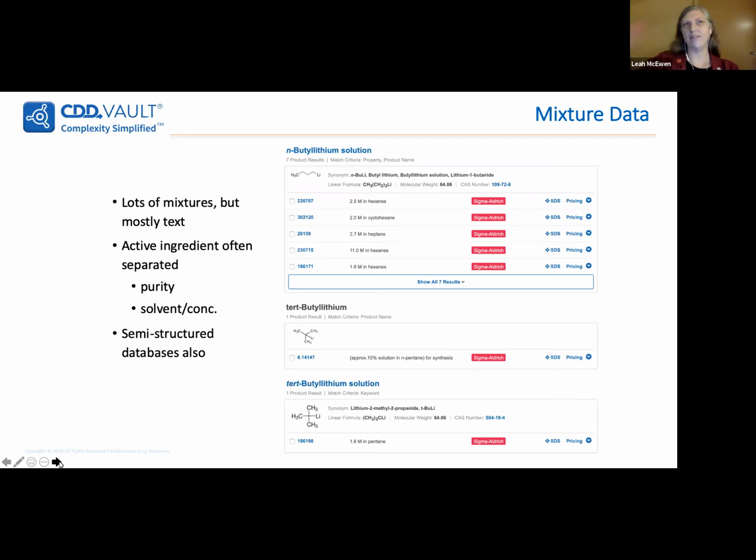And you could even think of downstream users further on, particularly consumers, for example, and right to know. You could also think about how this information could help you optimize your process within your own research core. You're always adjusting your solvent concentration, so you can track those experiments over time and optimize if you're able to describe this information more consistently.